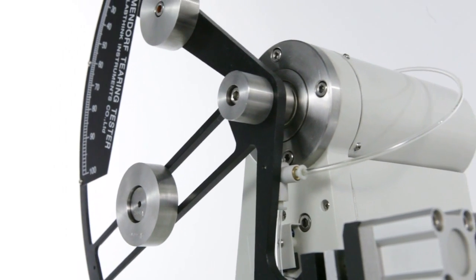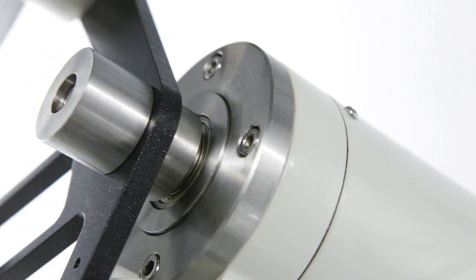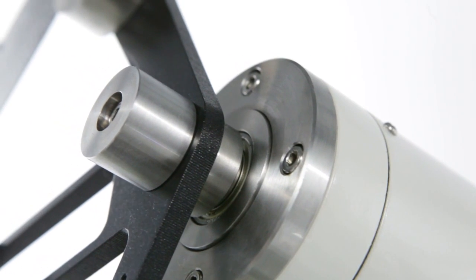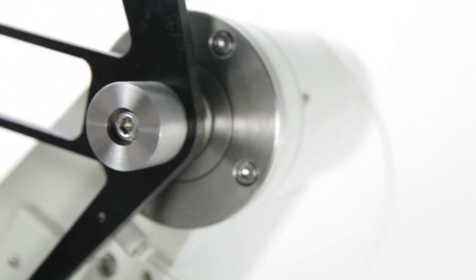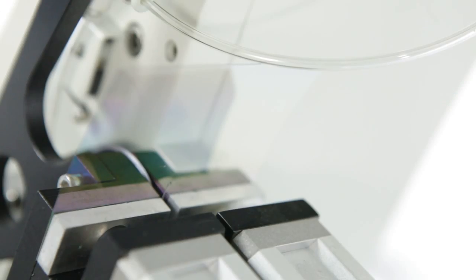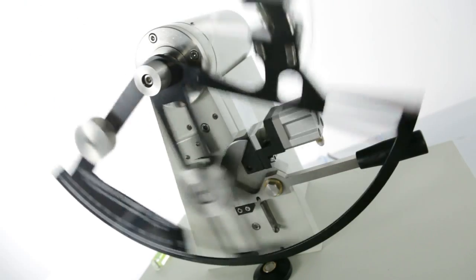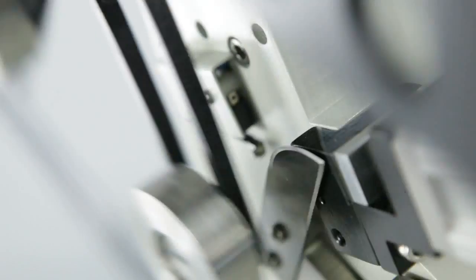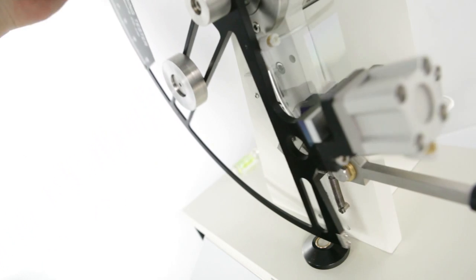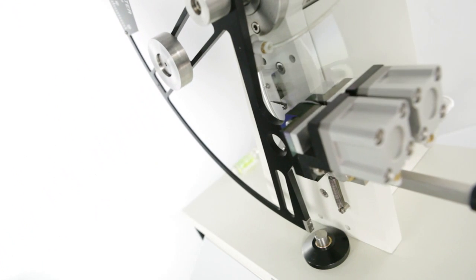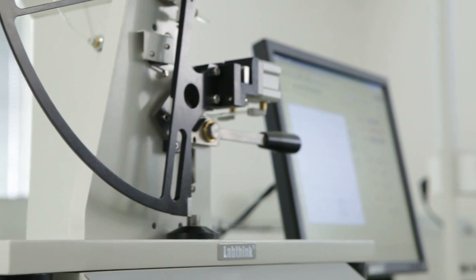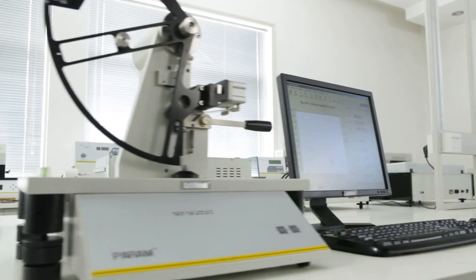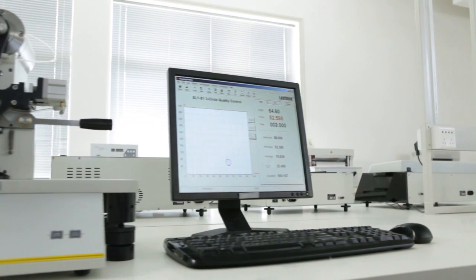The built-in high-resolution optical encoder measures the angular position of the pendulum during the sample tearing process and converts this measurement into tear units. This greatly enhances the accuracy and repeatability of the test result.